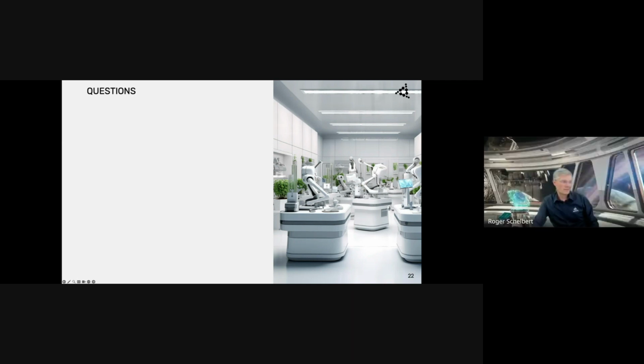Yeah, that normally depends on the application we have to fulfill, but most of it is the precise robot from Brooks, which enables us to make this human-replacing system. On the precise robot we have a TCP/IP server, and this enables us to make very good interfacing. Hopefully this answers the question.